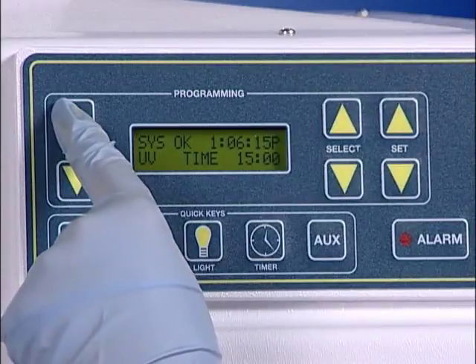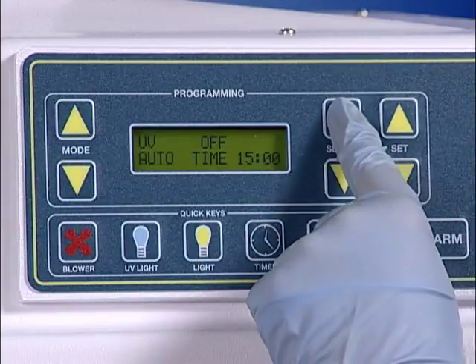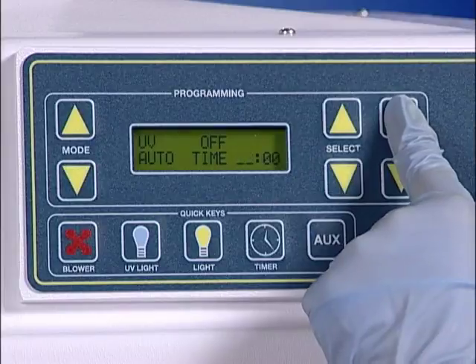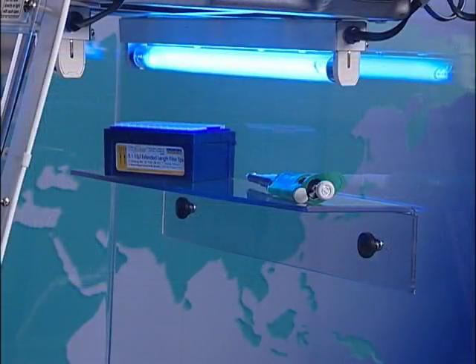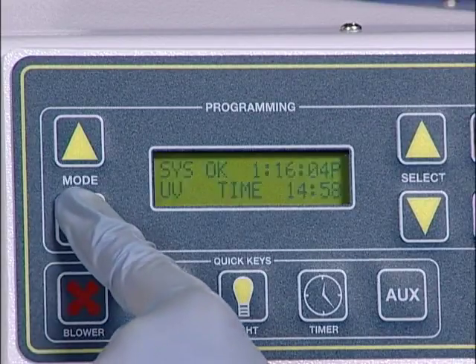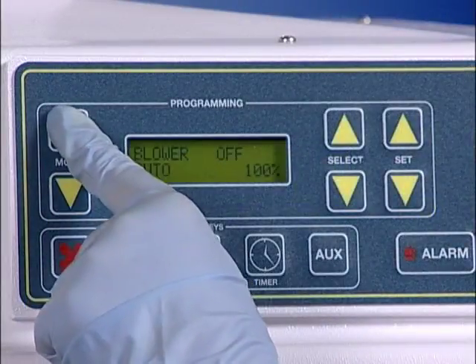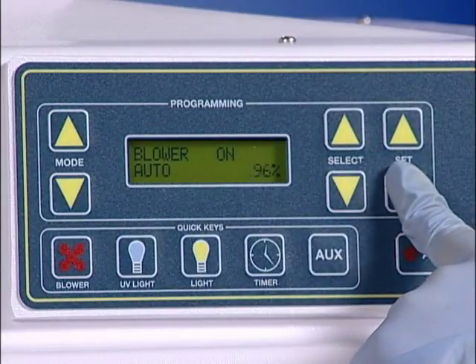A digital UV timer is incorporated into the UV-tect controller, allowing the user to set the irradiation time up to 59 minutes. One of the most important features the UV-tect controller provides is UV bulb monitoring. Each UV bulb has a definable useful life, and UV-tect monitors and alerts the operator when the useful life of the UV bulb has been reached. Replacement of the UV bulb is critical to ensure sterility between amplifications. The UV-tect controller also allows the operator to manually adjust the airflow, accommodating even the most fragile samples.